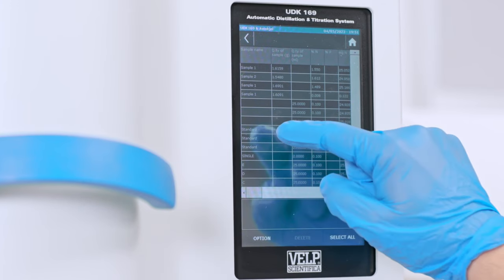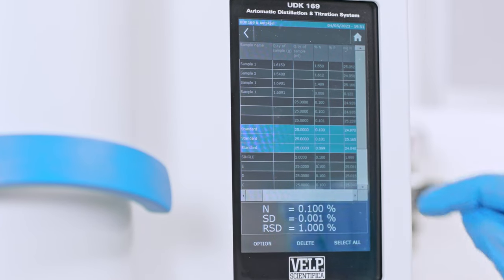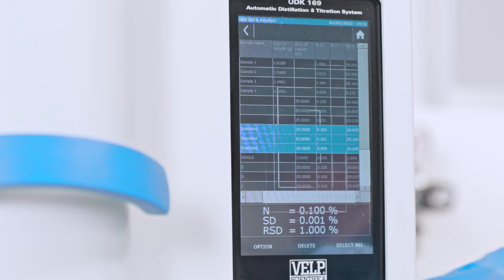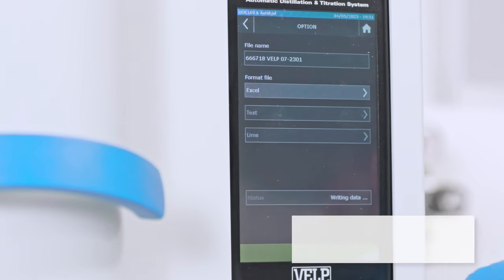The UDK169 stores the analysis results in the onboard archive. Export data to a PC and LIMS in multiple formats via USB or Ethernet.